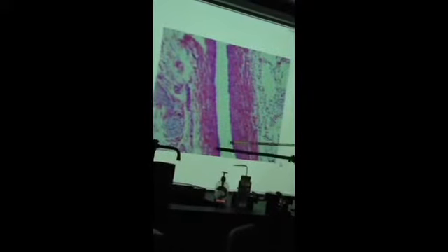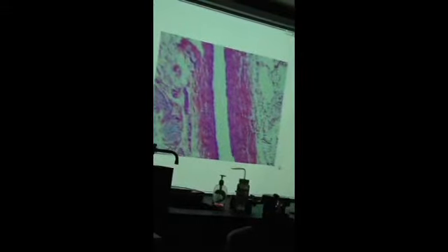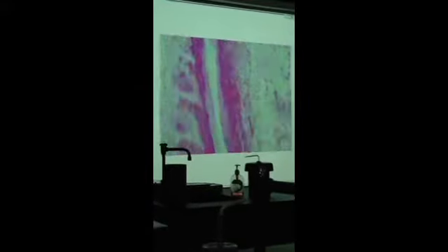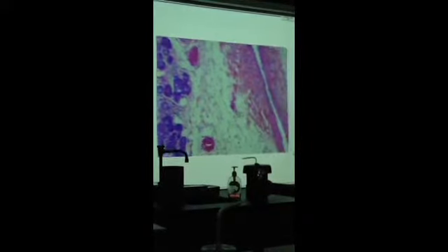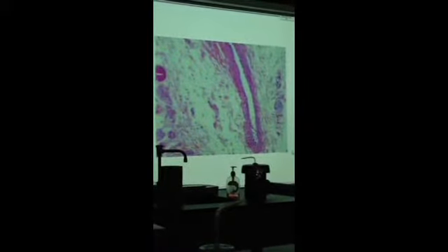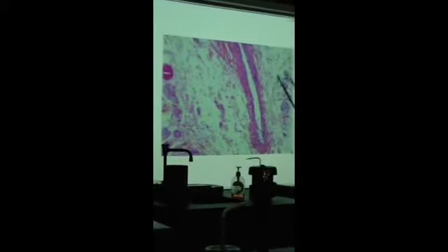These things over here are nerves, cut through. That's a blood vessel. Now look at the shape and the size here. Quite large. See, it's pretty much flattened. Vein or artery? It is a vein. A large lumen, fairly large size, relatively thin wall.